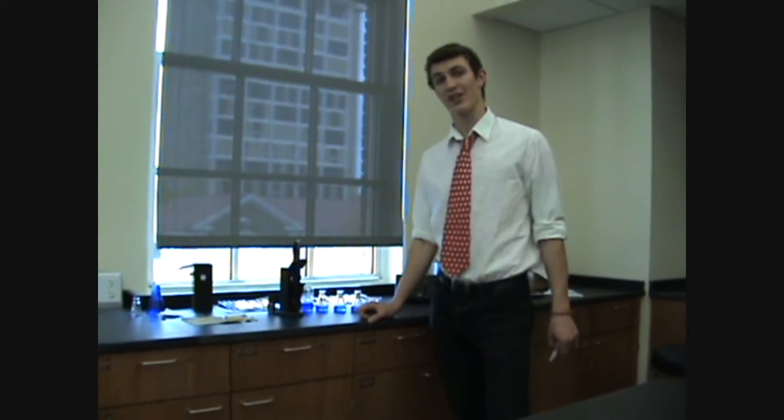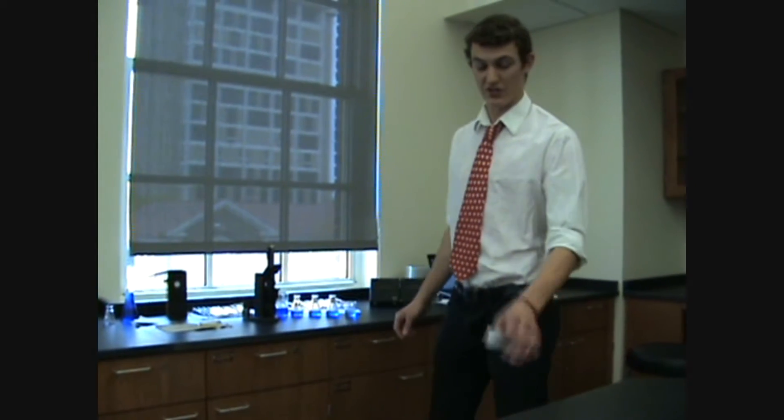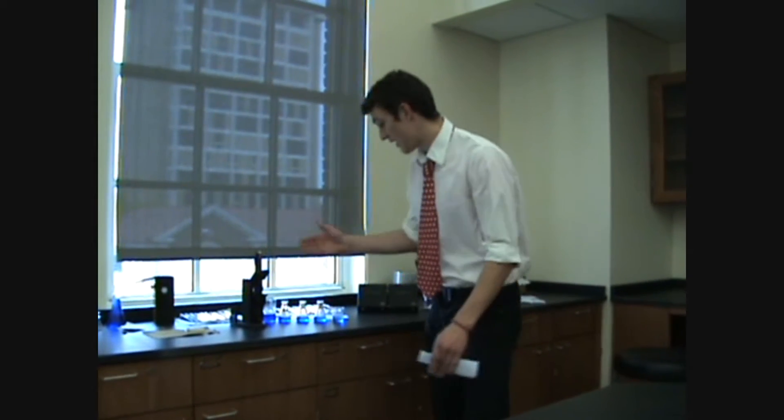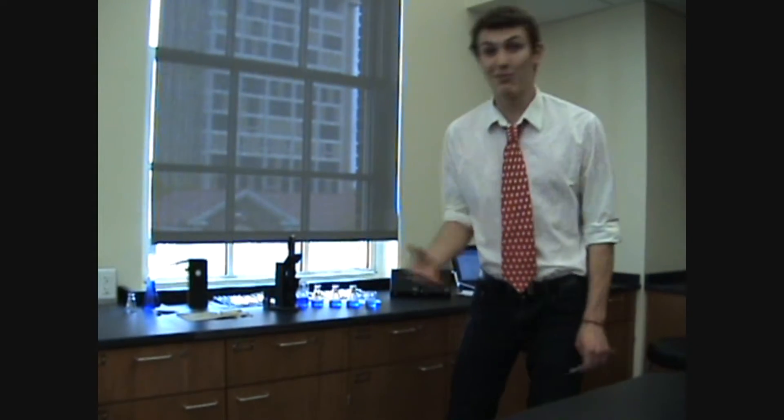This is a very old way to qualitatively determine the concentration of something in a solution. Sometimes, by looking at the color of a solution, you can figure out how much of that thing you have in it. That's pretty neat.